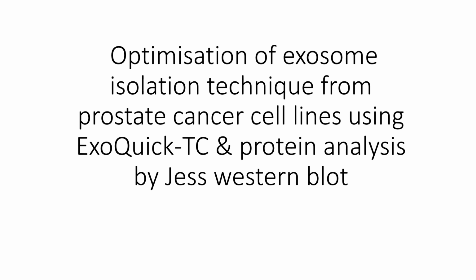My research is all about exosome, looking at how exosome can be a better alternative to current diagnostic procedure for prostate cancer patients. The topic of my presentation today is optimization of exosome isolation technique from prostate cancer cell lines using ExoQuick-TC and protein analysis by Jess blot.